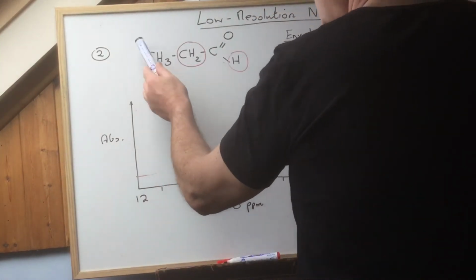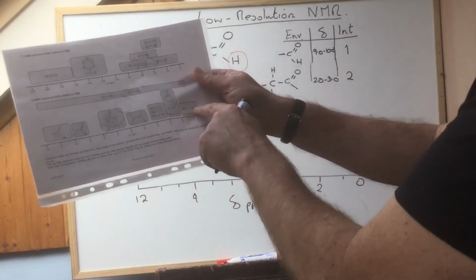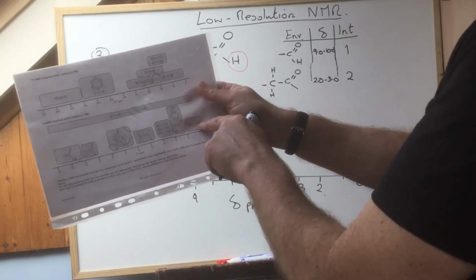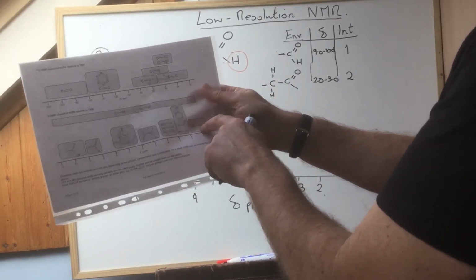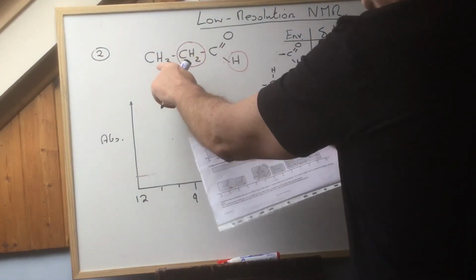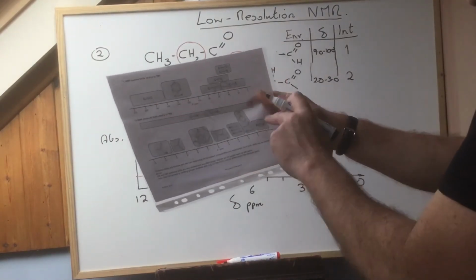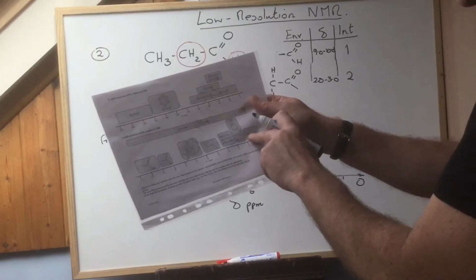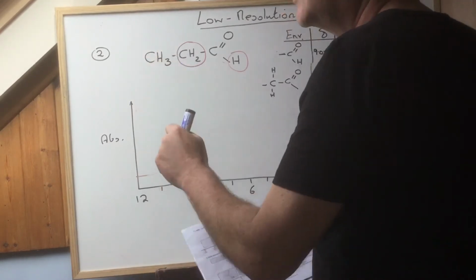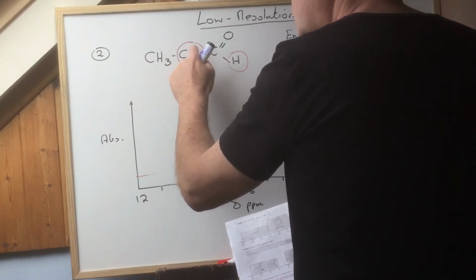Well, what environment are these? Well, this environment is this right at the end. That R isn't necessarily, to me, an alkyl group, right? Because you could think that those 2 are joined to a C, which is joined to an R, right? Well, it's not. These, it's H's. It's what this chemical shift is: protons joined to a carbon that are then joined to a carbon in a chain with protons on it.